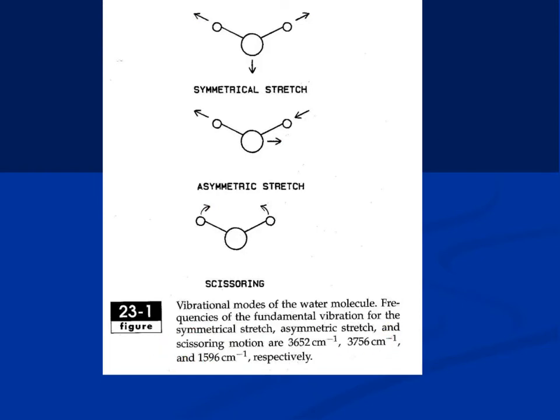And as I told you, some of the techniques use different kinds of symbols for units of wavelength, and in this case it's called wave number. So when you look at the spectrum of the IR, which I will show you in the next slide, it is shown in a different way than the normal spectrum we talk about in UV or visible spectroscopy.